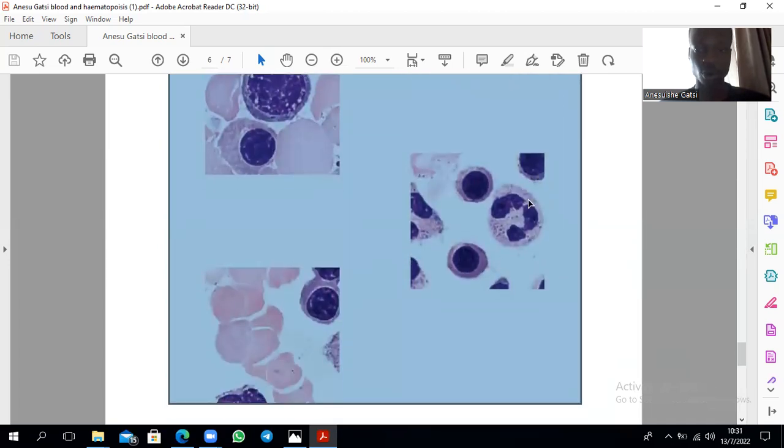Then these are orthochromatophilic erythroblasts and normoblasts. This right here is a neutrophil. These are orthochromatophilic erythroblasts. The nuclei are becoming smaller, as you can see. The cytoplasm is becoming more eosinophilic on the outside there, indicative of more and more hemoglobin. So that's your orthochromatophilic.